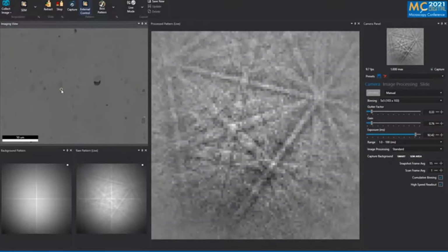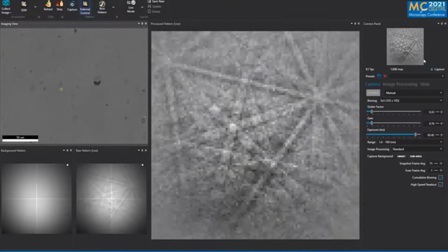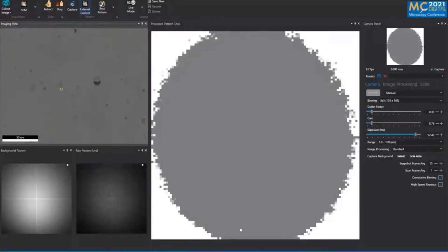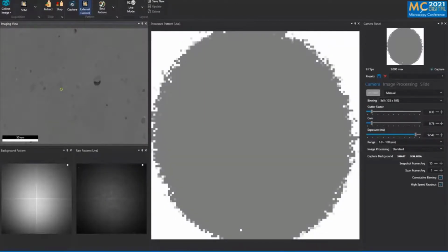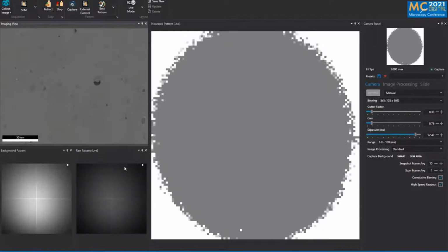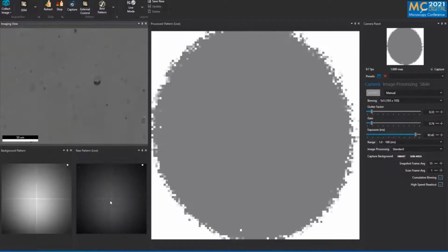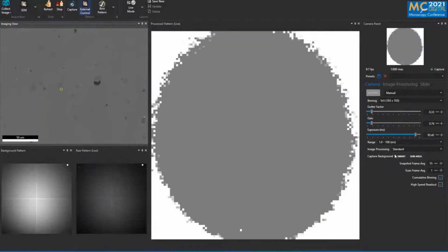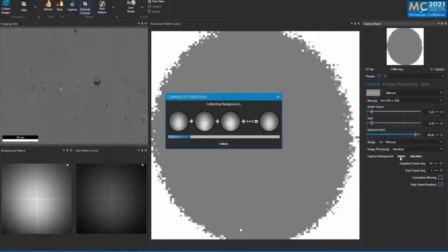If you want to push it a little bit further, I'm now going to about 35 picoamp. Actually, you can see it doesn't change too much in the live image. It gets a little bit darker here. So let me grab a new background for that.